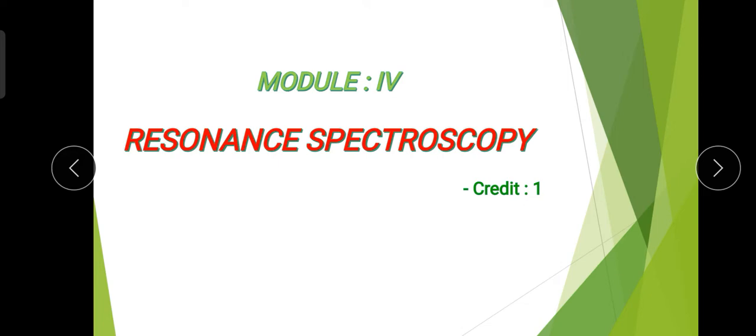That is, we have studied what NMR spectroscopy actually is. After that we studied the basic principle of NMR spectroscopy and how we get the spectra with the help of a transfer of energy between two levels in the presence of an external magnetic field. All of that happens due to radio frequency electromagnetic radiation. All those things we covered in our previous lecture.